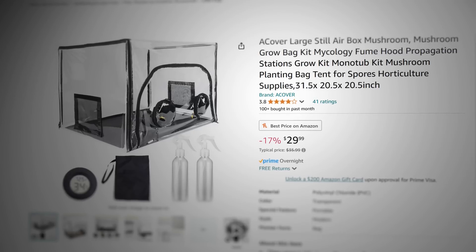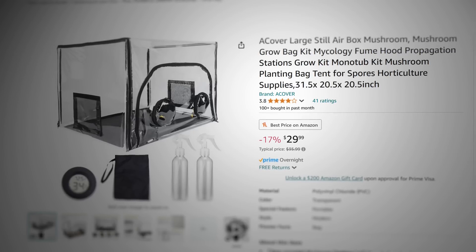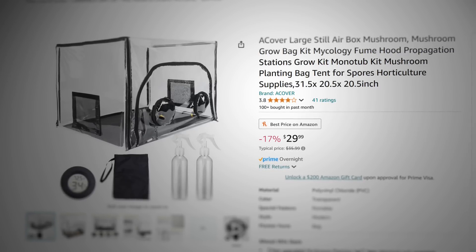What's up mushroom fam? It's Gary with Fresh From The Farm Fungi. Today I'm going to be unboxing a $30 still air box. If you're interested in the link for this still air box, it's going to be posted below the video.